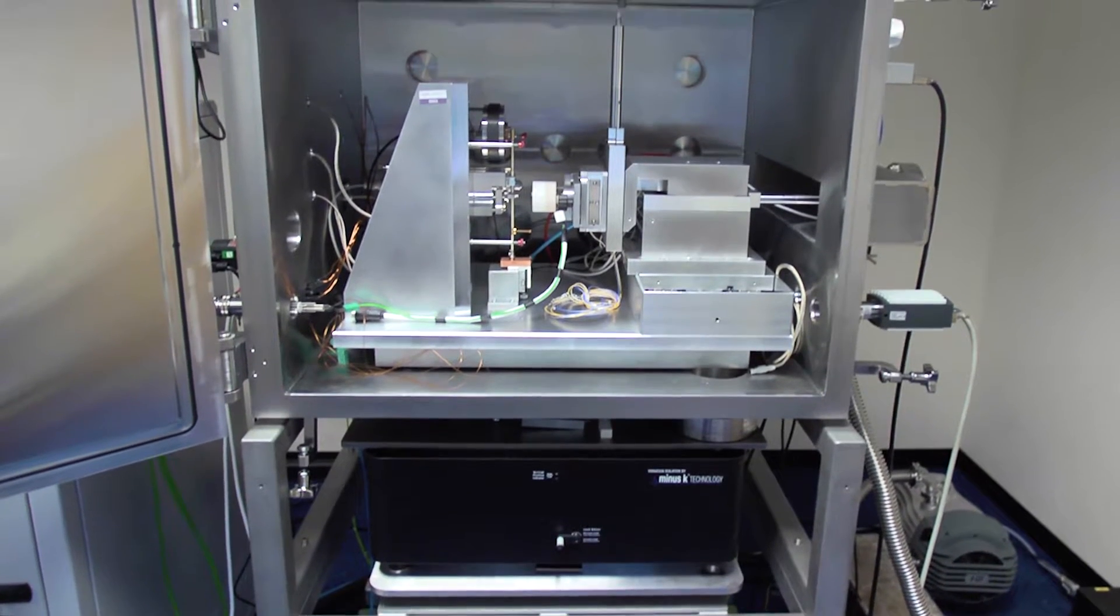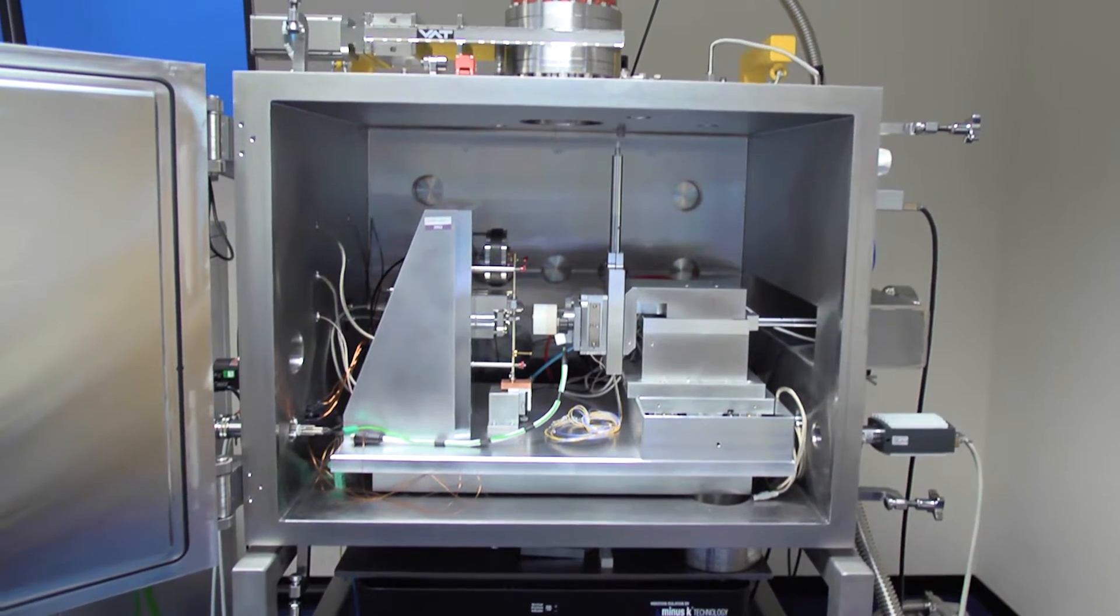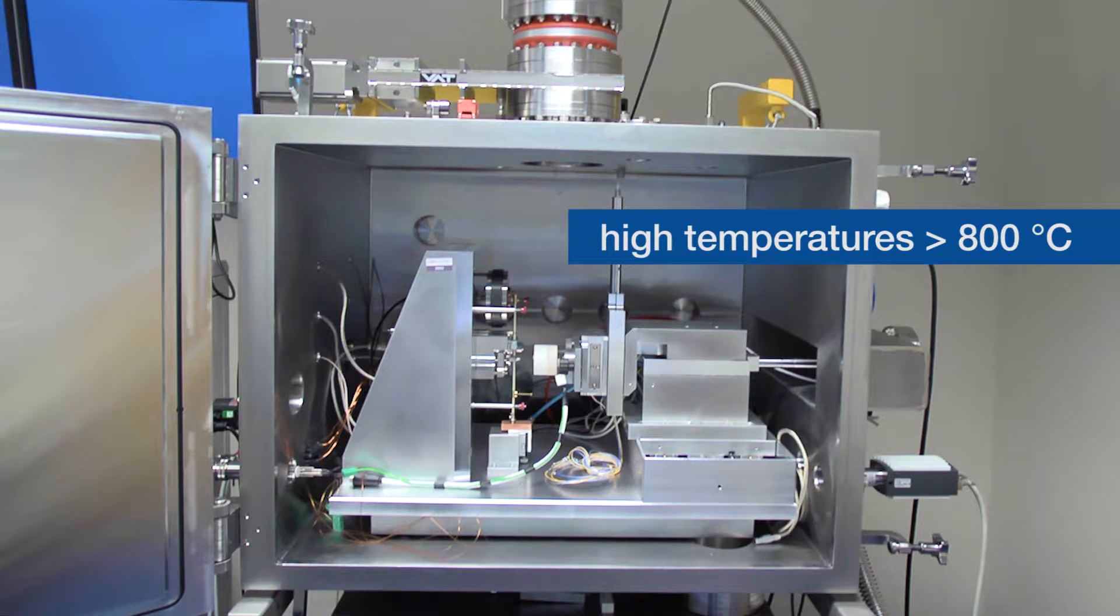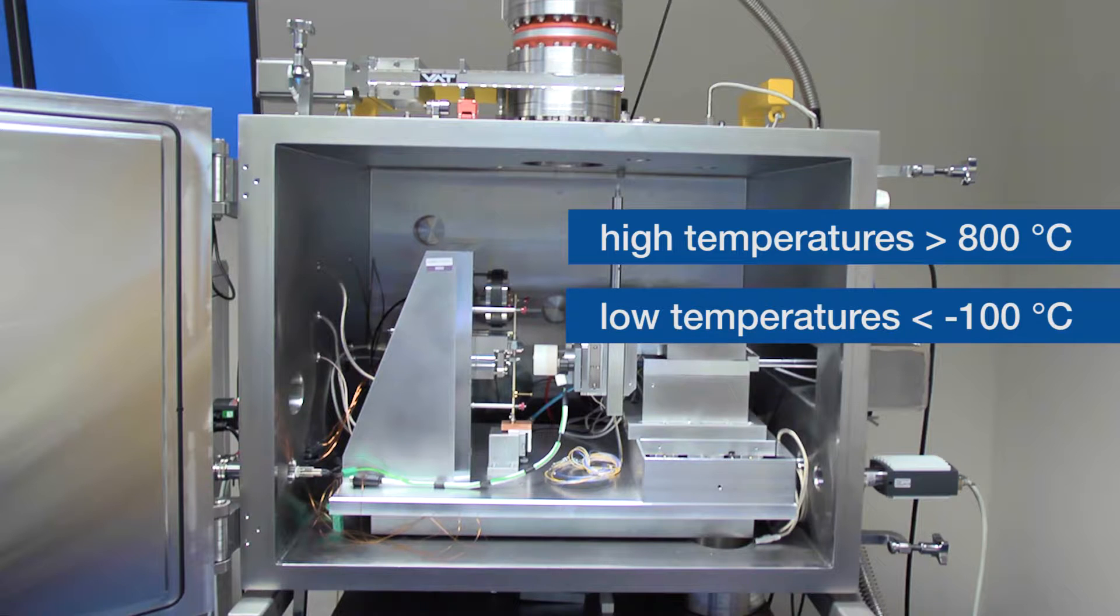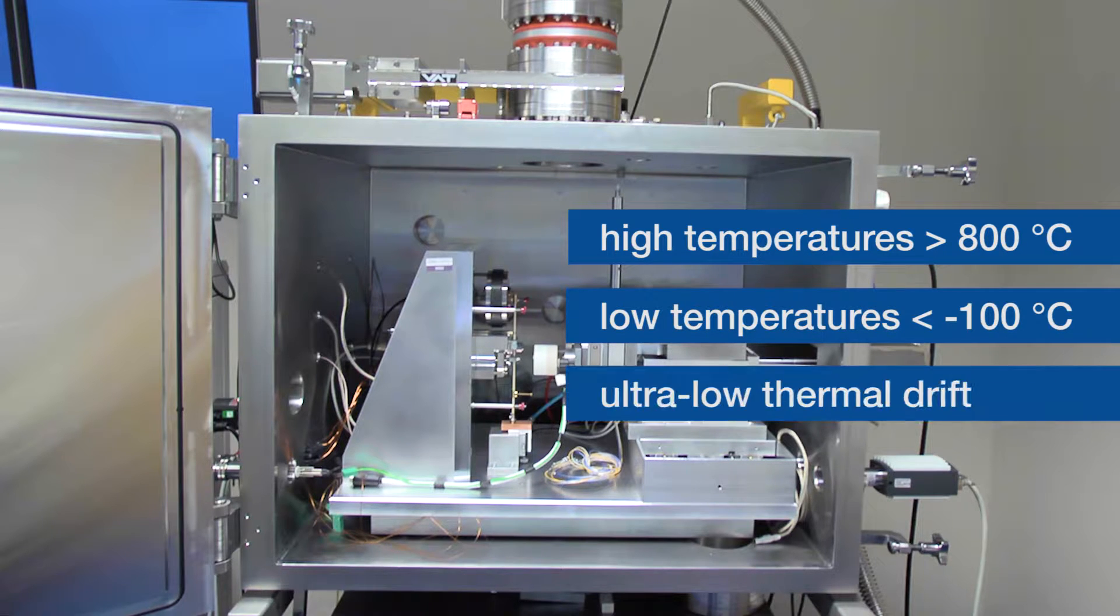The benefits to users include an extended high temperature capability beyond 800 degrees Celsius, enhanced low temperature capability to below minus 100 degrees Celsius, ultra-low thermal drift thanks to the design principles proven on the nanotest vantage.